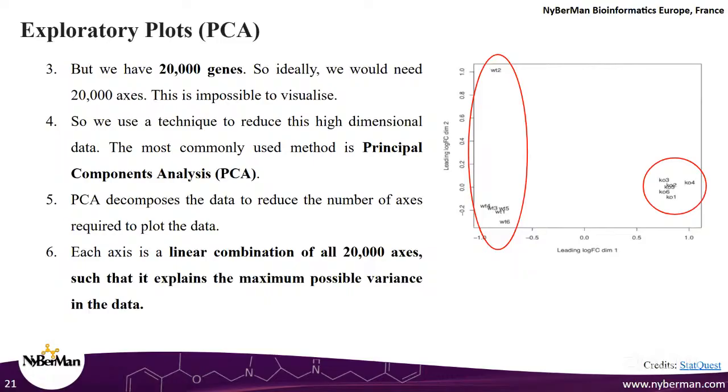It is pretty complicated, right? It falls under something called unsupervised machine learning. That is not something that we are doing right now, but we do use this regularly as an exploratory plot. And what I want you to understand is how you can actually interpret a PCA plot. You don't need to understand how the math works to plot it. I will teach you how to plot it in R, and how you can actually interpret it. But just remember, PCA helps you to reduce high dimensional data.